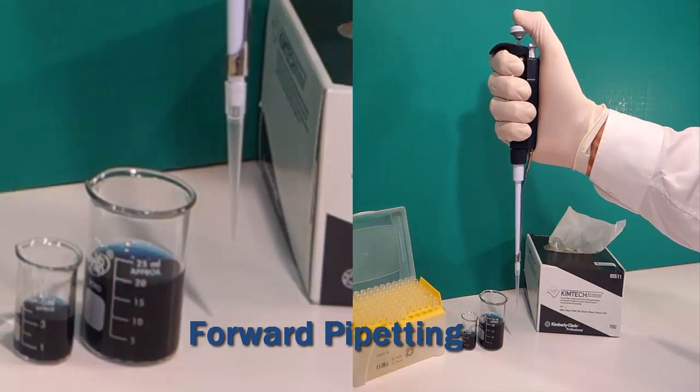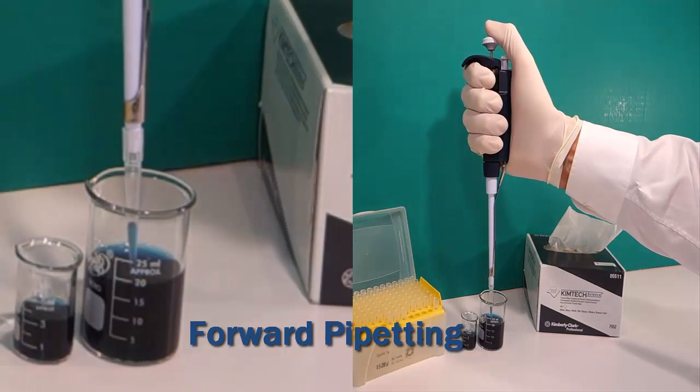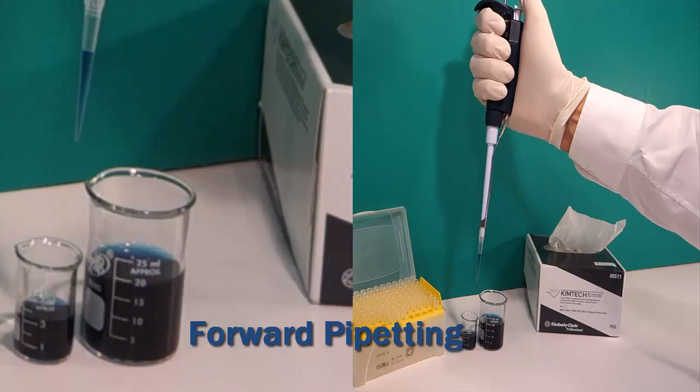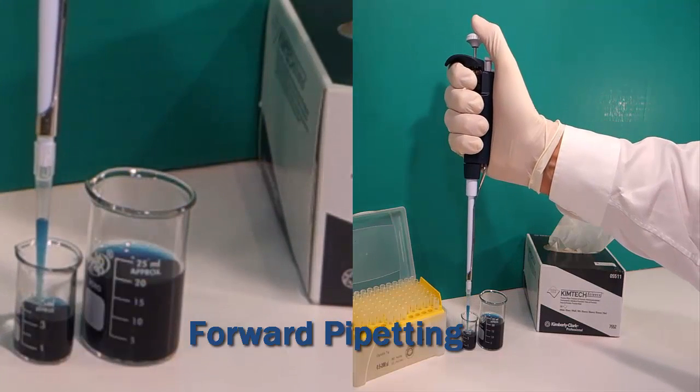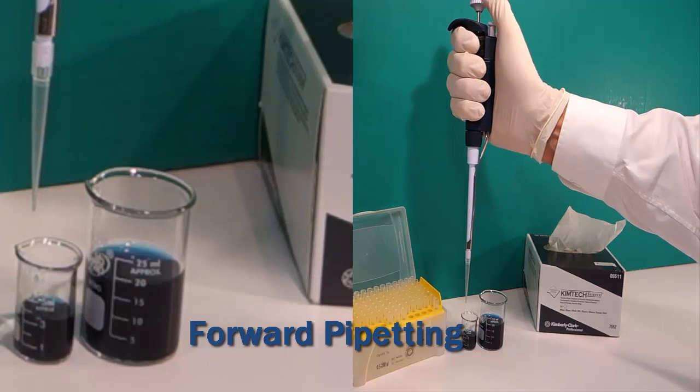To demonstrate forward pipetting: push the plunger from the top to the first stop. Put the tip into the liquid and slowly release the thumb knob to aspirate liquid into the tip. Deliver the liquid by pushing to the first stop and then through blowout to the second stop.